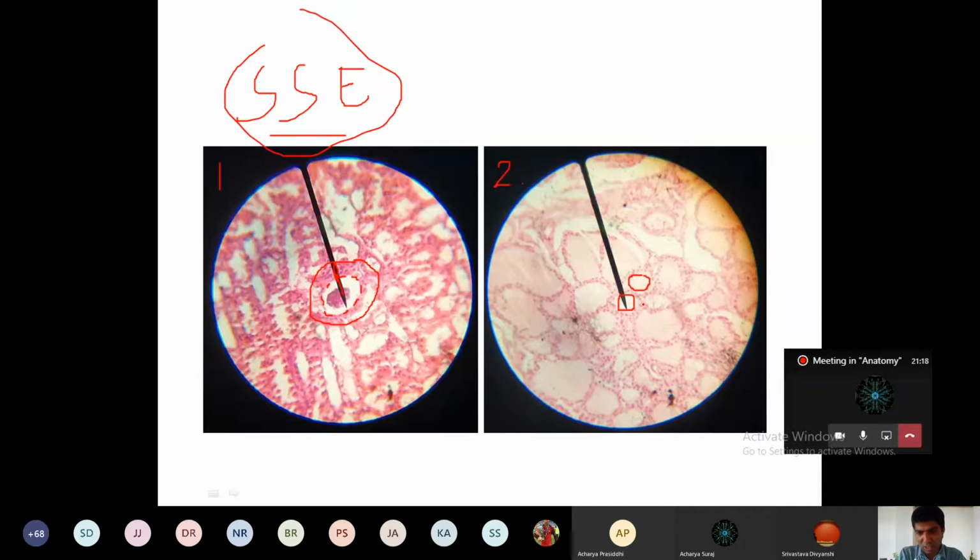Thyroid follicle is lined by the simple cuboidal epithelium. And the features, I think you know it. It has the length and breadth of the cell the same. Okay, cuboidal cell you can say, and inside the cuboidal cell, what is there? There is a very peculiar round nucleus in the central position, isn't it?